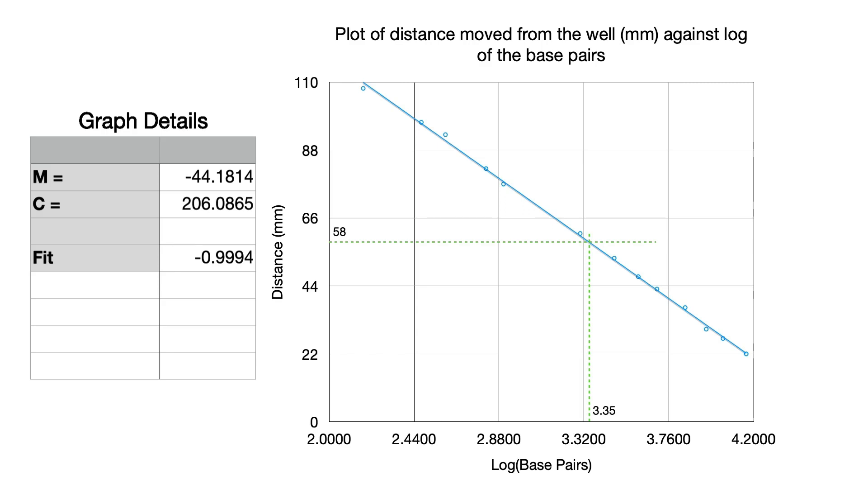If we look at the correlation we've got a correlation of minus 0.9994 which is good so it's a good fit. And then we can put in our unknown, 58, so we're just using the y equals mx plus c equation.